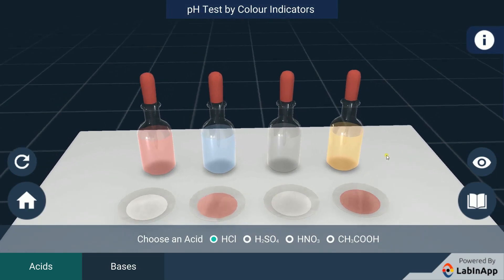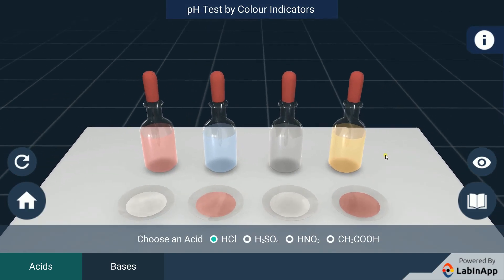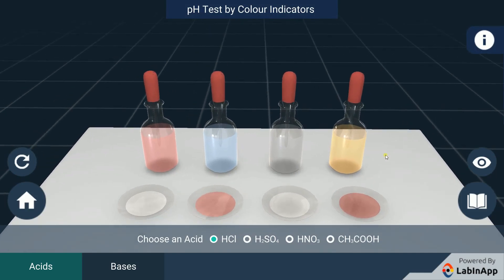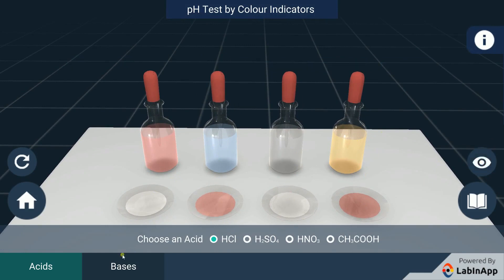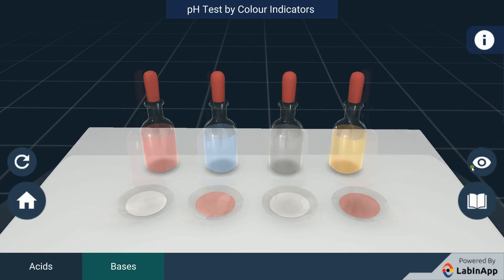We have observed that the blue litmus solution changes the color of acid to red, and methyl orange changes the color to red, whereas red litmus and phenolphthalein don't. We have taken a base solution in four different watch glasses.